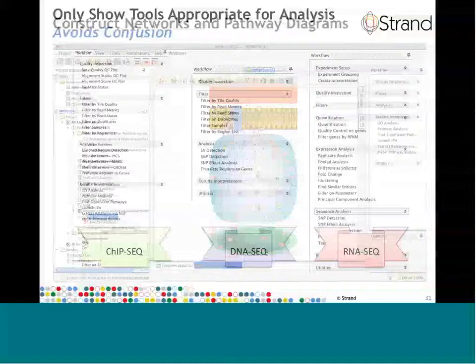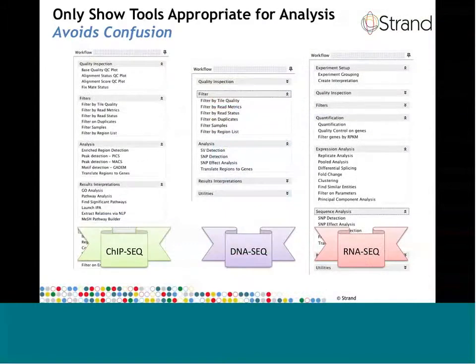Okay, so before we open up the floor for your questions, there are two more items I would like to discuss at this point about Avadis NGS. So the Avadis development platform that we use to develop Avadis NGS is a platform that was developed by Strand to be applied in a wide variety of application areas. We have applied the Avadis platform to such wide-ranging areas as array-based gene expression, like in GeneSpring GX, mass spectrometry, like in Mass Profiler Pro, and also quantitative structure-activity relationship, or QSAR, in the program called Architect.